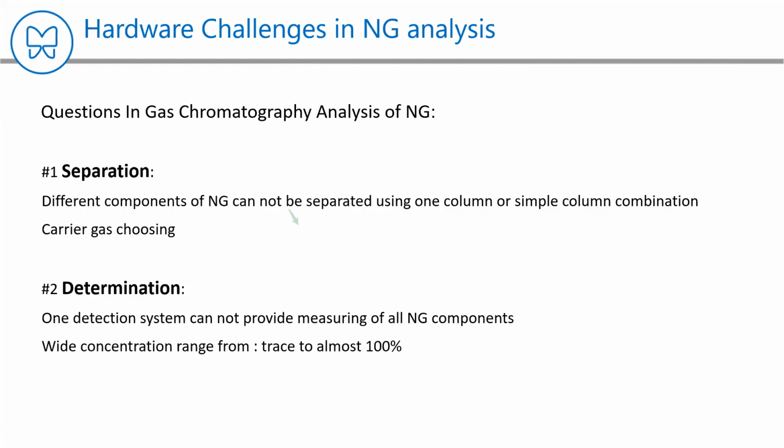One common question we have, especially from people who are beginners in chromatography, is why we need a special analyzer for natural gas. Why can we not use any normal GC for natural gas analysis? Here we should mention that we have two sides of the challenges. The first one is related to the hardware.